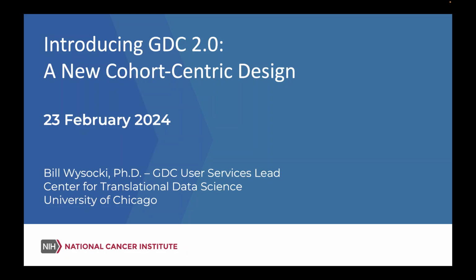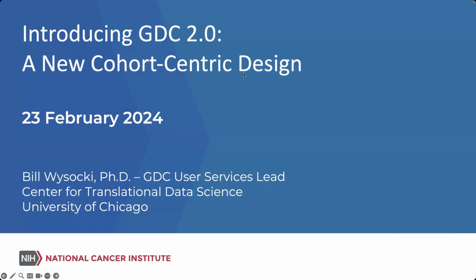All right, so today I would like to introduce to you GDC 2.0, a new cohort-centric design. My name is Bill, and I am the lead for GDC User Services. And let's get started with this presentation.